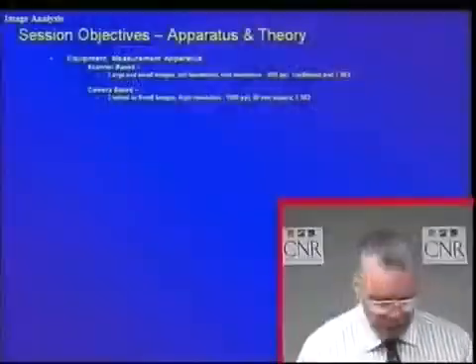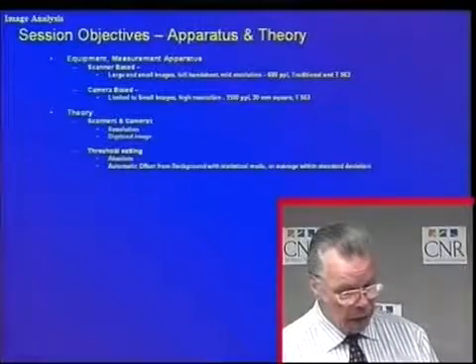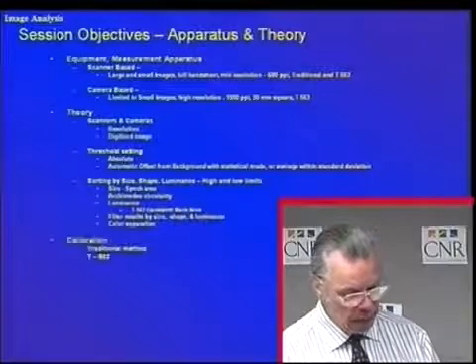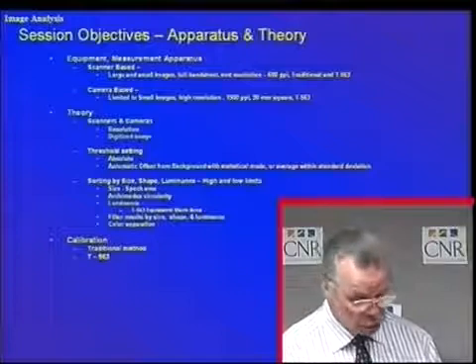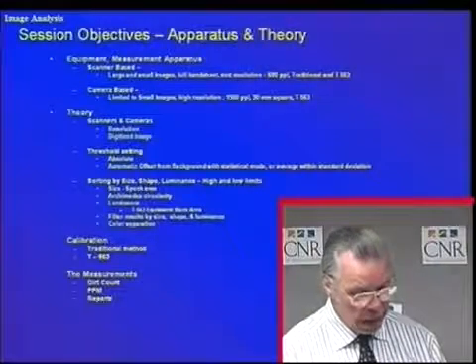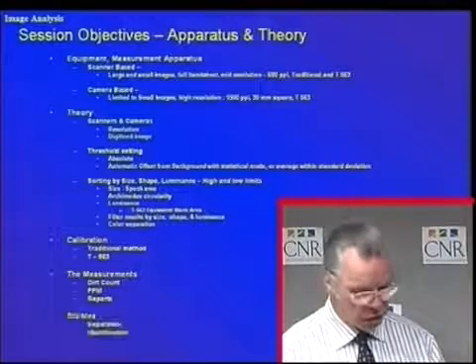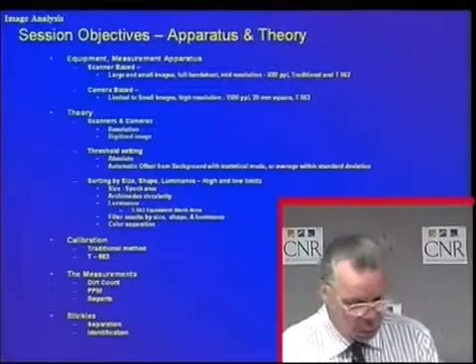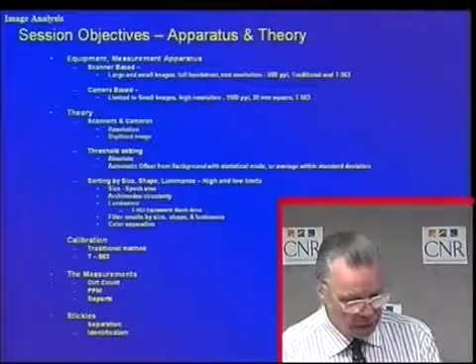What we're going to be doing is covering the equipment, the theory, and how to set thresholds in various elements like this, the calibration of the units using the traditional method or the process control method, and TAPPI 563, and the measurements, the dirt count, ppm reports, and so forth. And then we'll talk a little bit about stickies and how you can quantify the measurement of stickies.